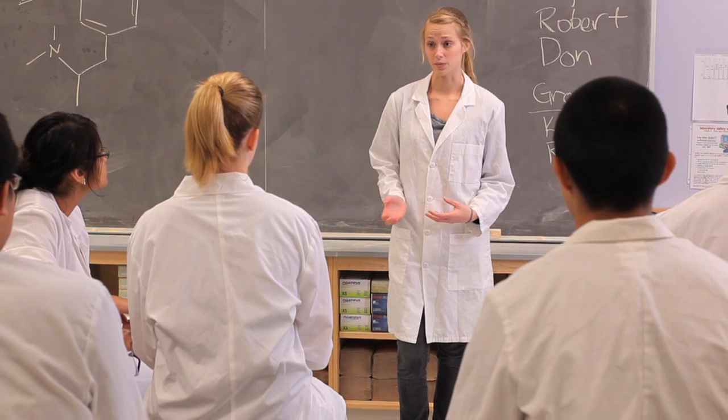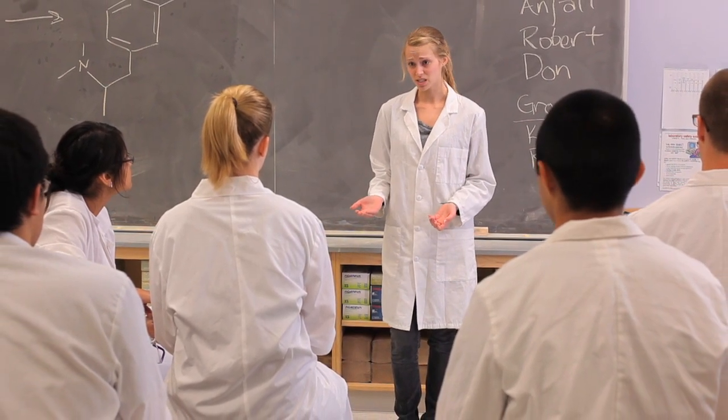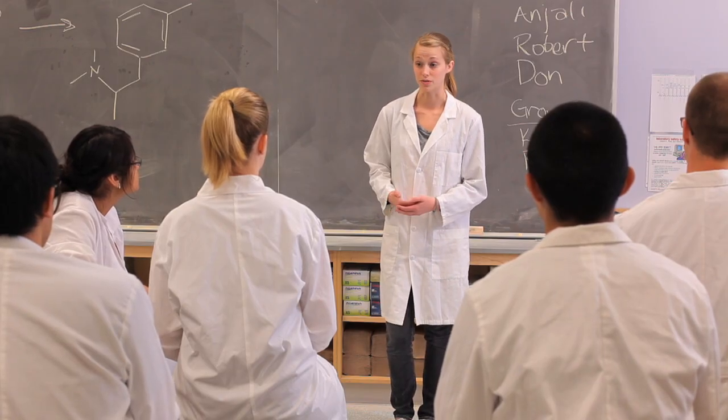Remember that if we need to evacuate the lab, everybody needs to gather outside so that we can account for all of the students. In this lab we'll be working with various individual experiments, so make sure you read all of the bottles of the reagents carefully before you start using them.